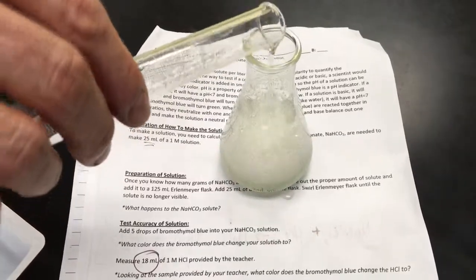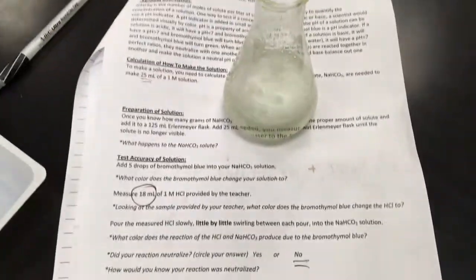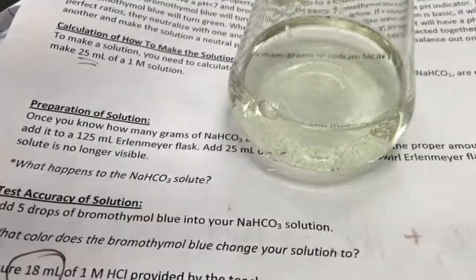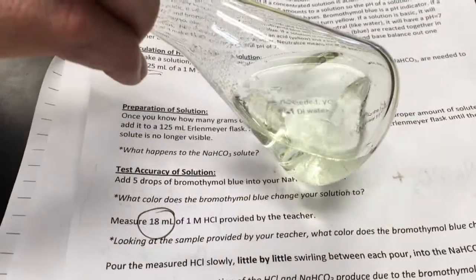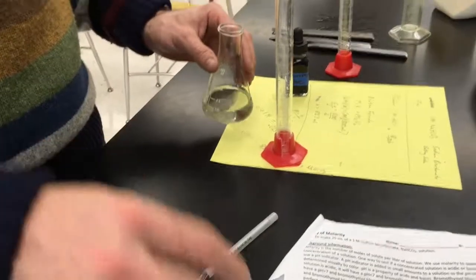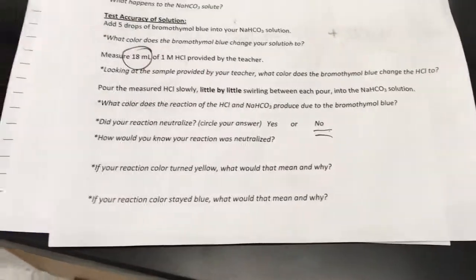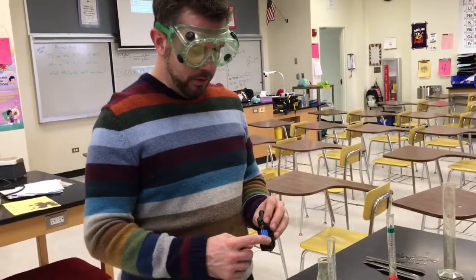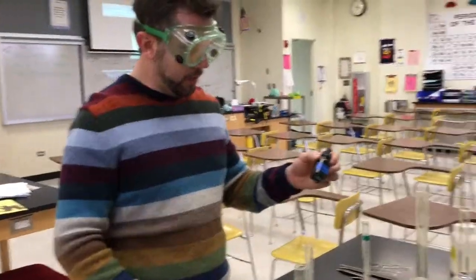Oh yeah. Whoa. And then we've got almost a little greenish tint, a little yellowish tint, a little green. I think it's green. You got a nice green tint to it. Yeah, very good. Yes, it is definitely not yellow. Okay, green. Awesome. Good job. So now we've kind of neutralized it, and there's a few questions that go along and ask you about neutralization. And we'll get into pH more. Once again, this was an indicator. This is bromothymol blue, and in the presence of acid, it'll go yellow. In the presence of base, it'll go blue, and if it's right in the middle, it'll go green. So there you have it.